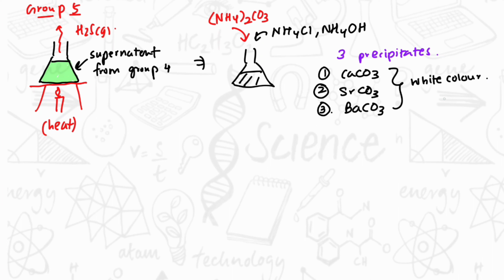As a result, we use the flame test in order to identify them, in which calcium 2 plus, or the calcium carbonate compound, will give us brick red color.